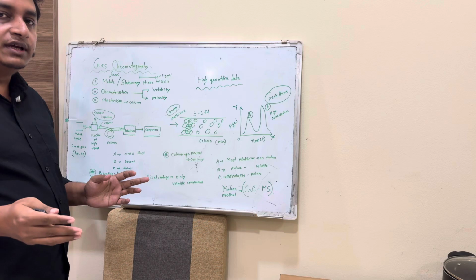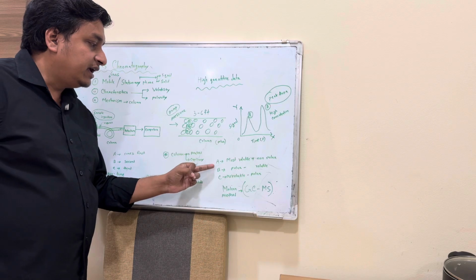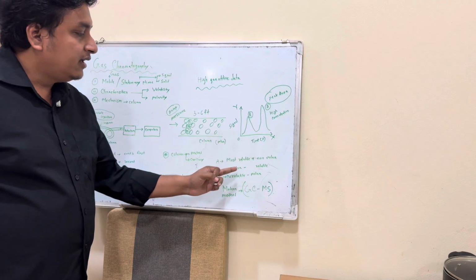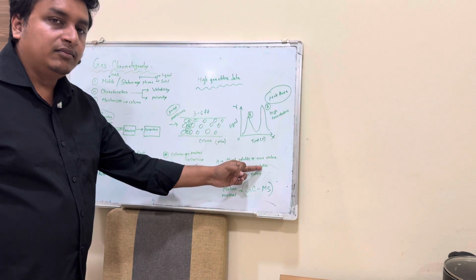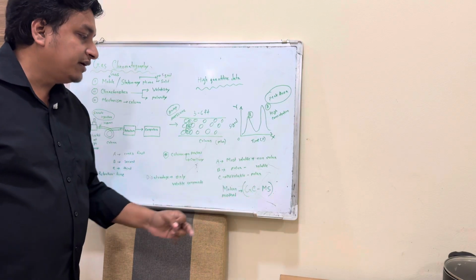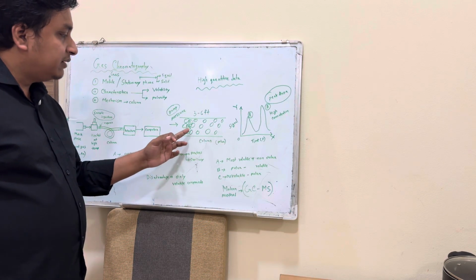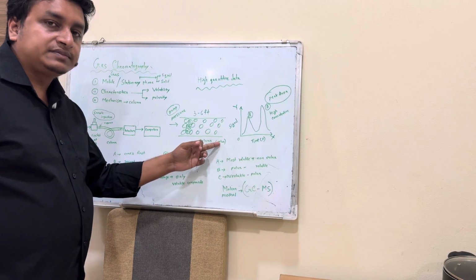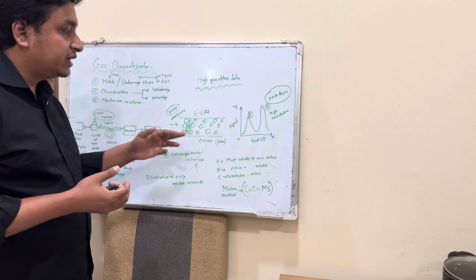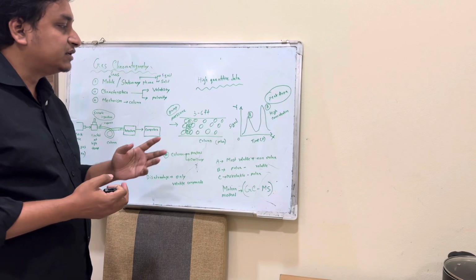If we want to know more details, for example, we have three compounds, A, B, and C. A is the most volatile and non-polar. B is polar but volatile. And C is medium volatile but polar. For example, this column can be 3 to 6 feet. If the column is polar, and the molecules going through are also polar, they will react with the column and it will hold those compounds. So they will go last.